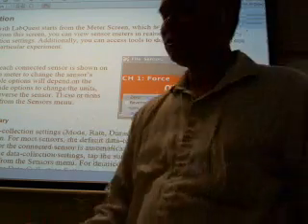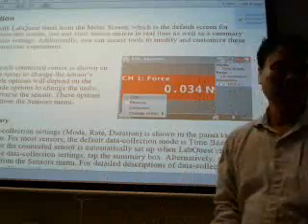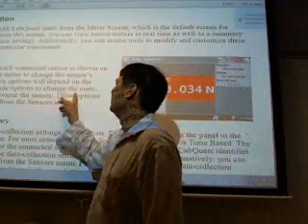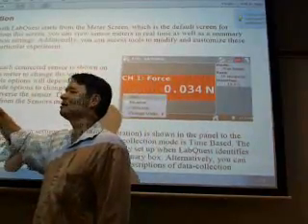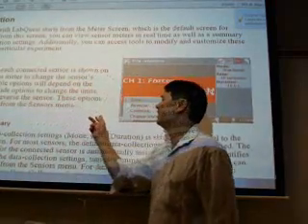These options can also be accessed from the sensors menu, but we don't have any calibrate. There are other options. Sometimes when you tap on it, we can change the units. Can we calibrate? No, we can't. These are fixed calibration. We can zero it. We can reverse the sensor, etc.